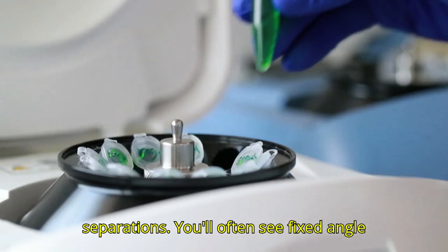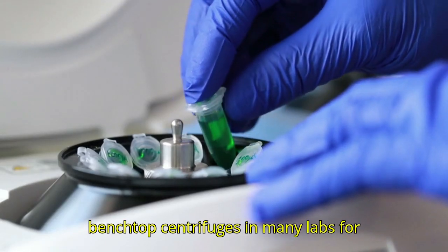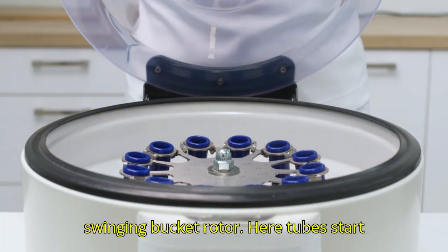You'll often see fixed-angle rotors used in microcentrifuges and benchtop centrifuges in many labs for tasks like DNA precipitation or protein purification. Next is the horizontal or swinging bucket rotor.